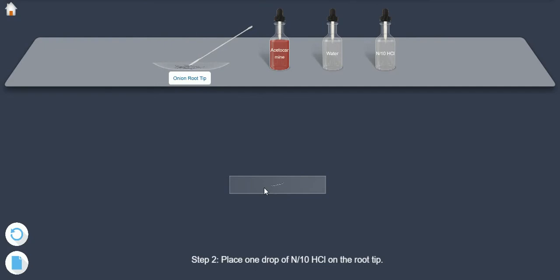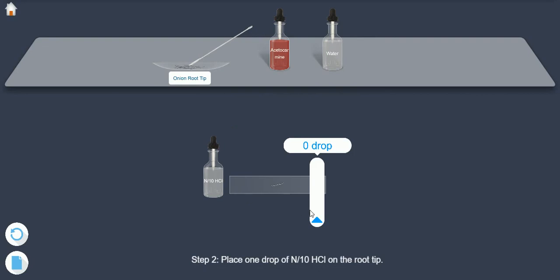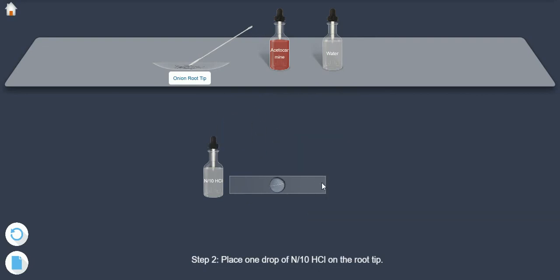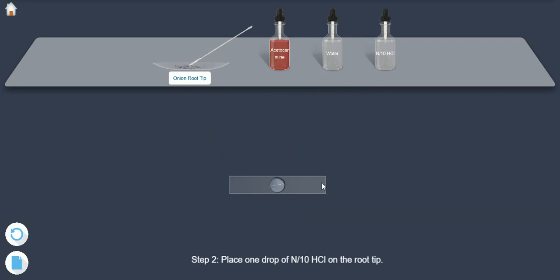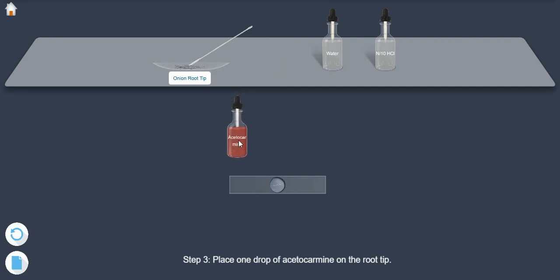Step 2. Place one drop of N by 10 HCl on the root tip. Step 3. Place one drop of Acetocarmine stain on root tip.